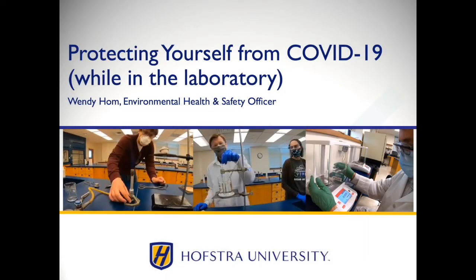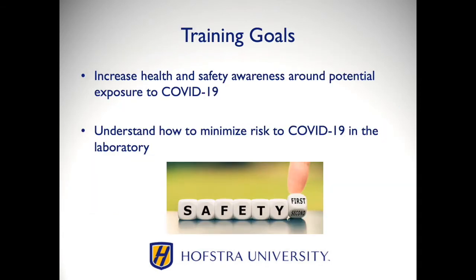Protecting yourself from COVID-19 while in the laboratory. The two main goals of this training are to increase health and safety awareness around potential exposure to COVID-19 and to understand how to minimize risk to COVID-19 in the laboratory setting.